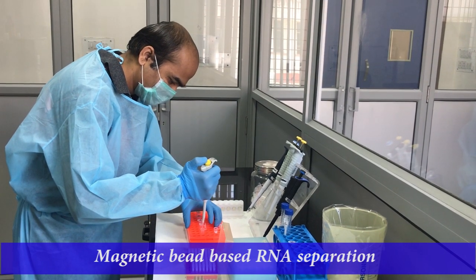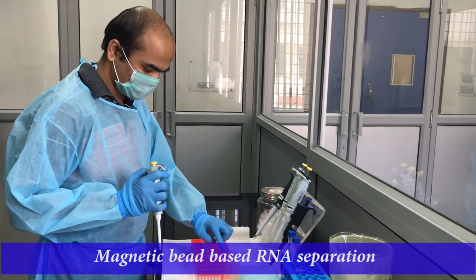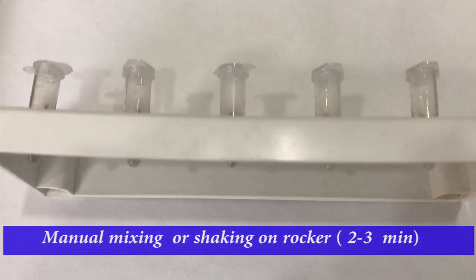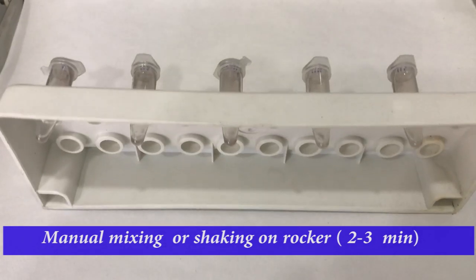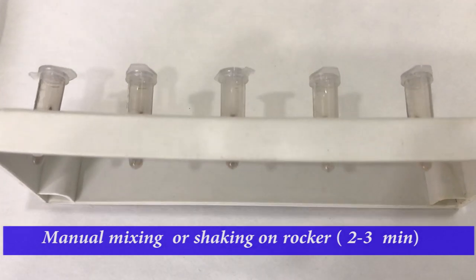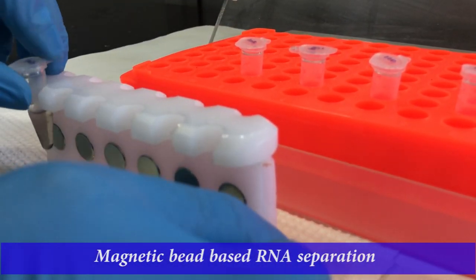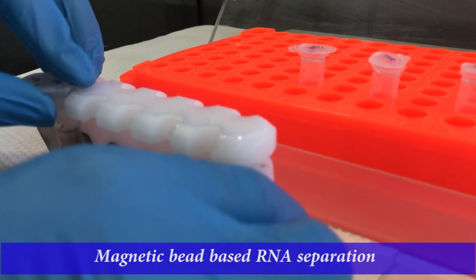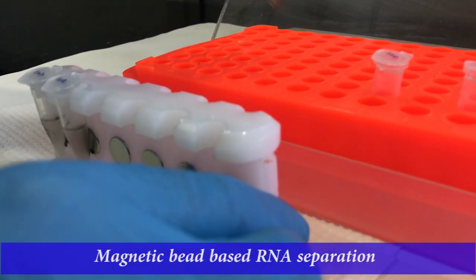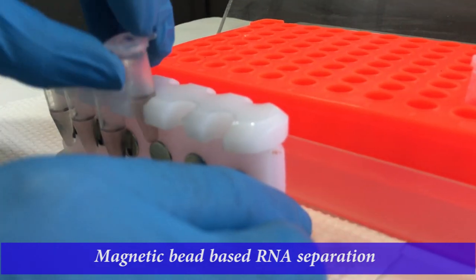An important step is the mixing of beads with RNA, either manually or on a rocker if available in the laboratory, at room temperature for 3 minutes as shown in the video. The magnetic beads are separated by keeping them on the magnetic stand for 1 minute. The magnetic beads are attracted towards the magnet.